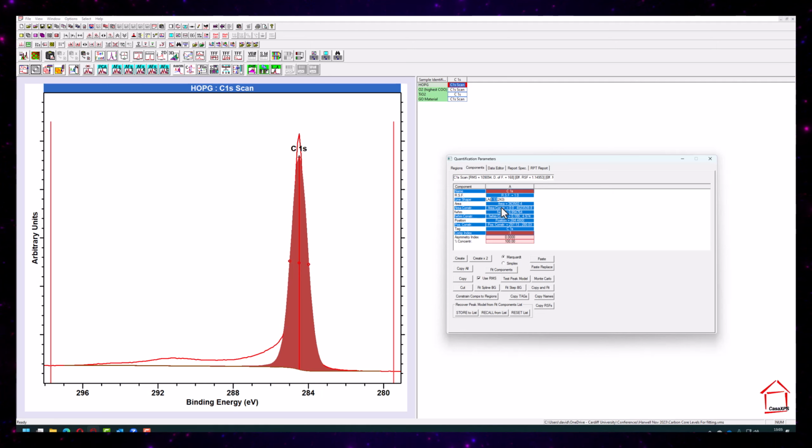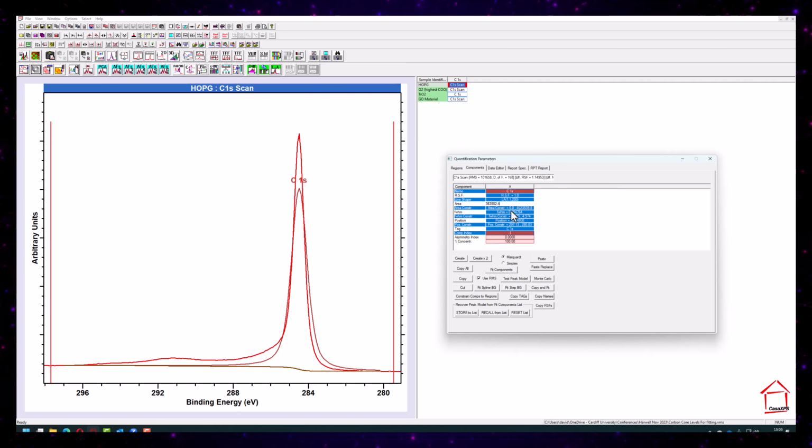You can play around with that number and see how it changes the peak. So let's just go for 1,1 to start with, and we'll go for 200. And we get this Voigt-like or Lorentzian type function.